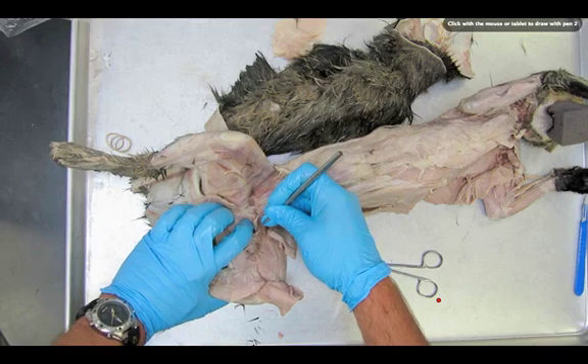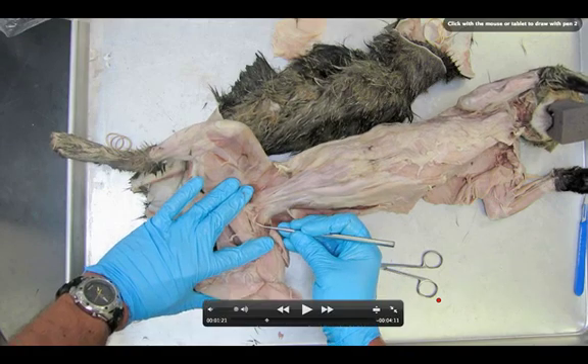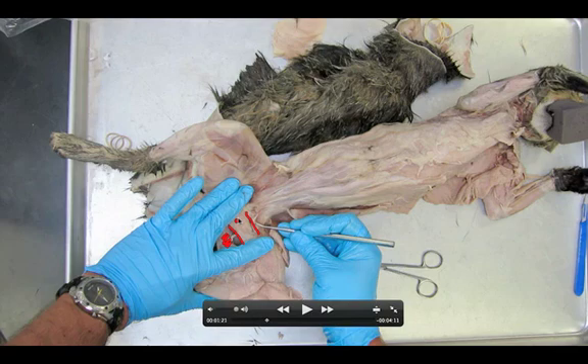You might see this line here and this line here. This is the semi-membranosus and this is the adductor femoris. Notice there's a white line right here in the middle — one of the most common mistakes is that people follow this line and turn the adductor femoris into two muscles. Please don't do that — keep it as one muscle.